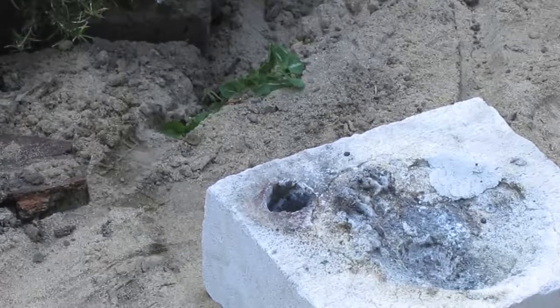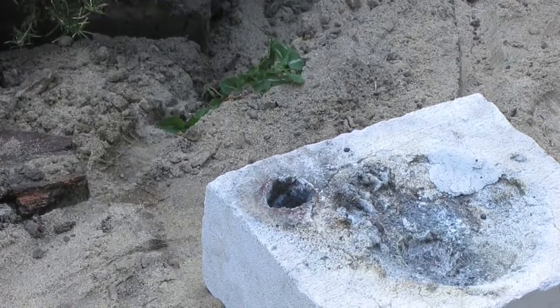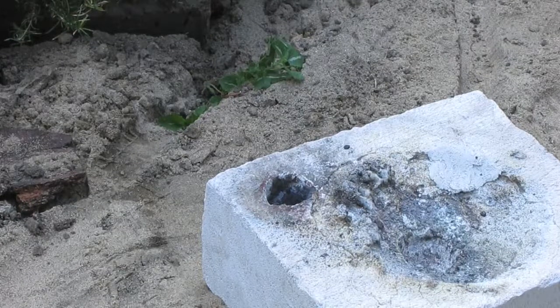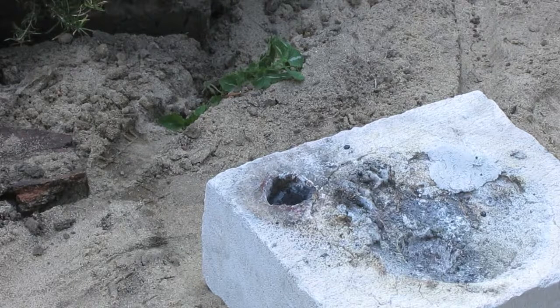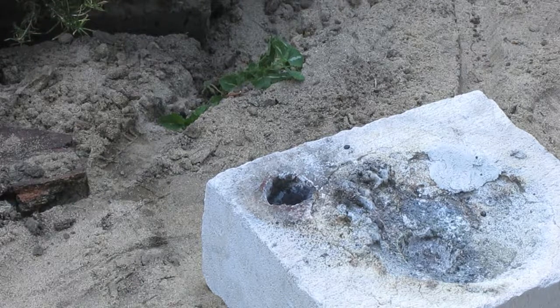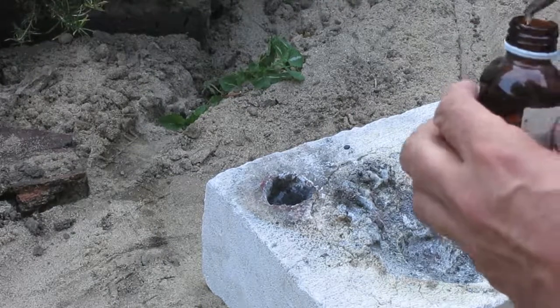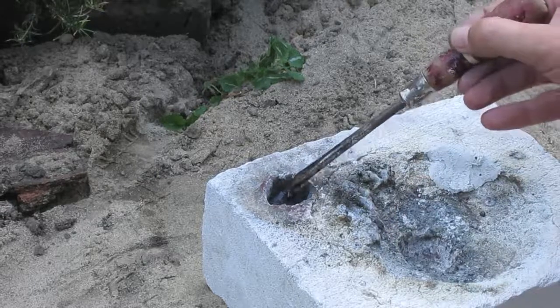This is potassium chlorate, aluminum, and SiO2. The reduction of SiO2 with aluminum is not self-sustaining, so I add some potassium chlorate to keep the reaction going. Now ignited with KMnO4 and glycerin.